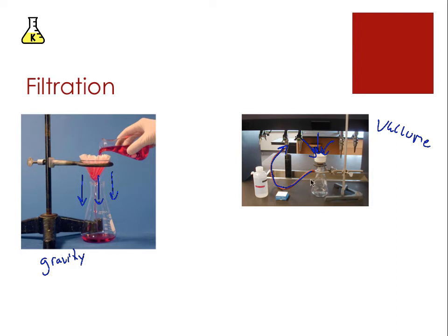This filtration process can be done in a matter of seconds as opposed to the minutes, hours, or days it can take for gravity filtration. Vacuum filtration also has its limitations, but generally speaking, it's a faster alternative for filtration.